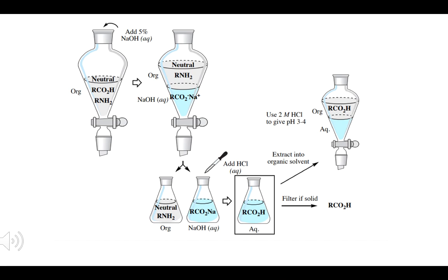If I want to remove an amine from an organic mixture into the aqueous layer, I'll add acid. The acid is not going to mix in the organic layer, so it's in the aqueous layer. Amines get a positive charge from it and travel to the aqueous layer. The positive charge won't affect the carboxylic acid, so that's fine. So we can take out amines from the organic layer. Once we do that, we'll have a layer filled with carboxylic acid and some hydrocarbons, and we'll have separated the amines.